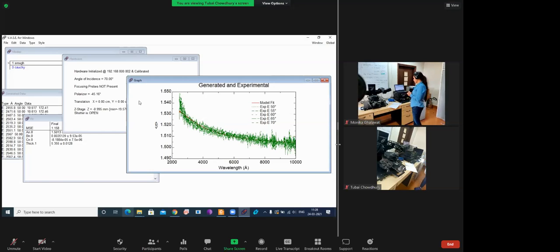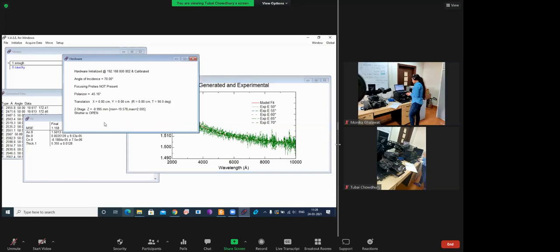Okay, so the next step will be, we'll go with the same kind of slide. We have just put a black background by using a simple marker. We just made this small area black background. So is it visible? I think from here. So we'll try this sample.